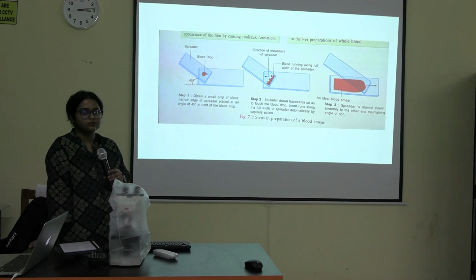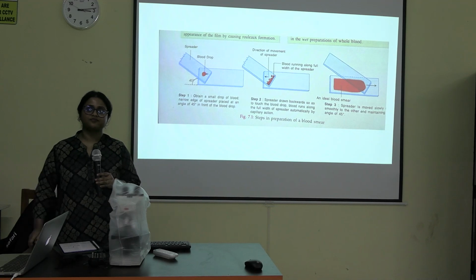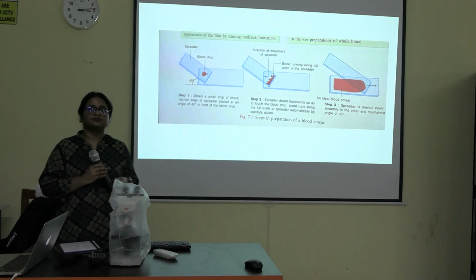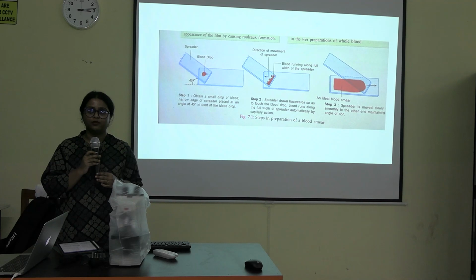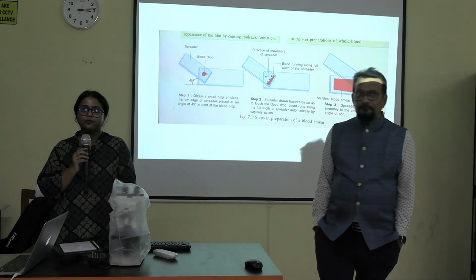One is eosinophil, one is basophil. Okay? So you have to identify all those things. That's why the name is given. Eosinophil because it is stained by eosin, and basophil stained by methylene blue. Granules are stained basically. So the third component is acetone-free methyl alcohol.